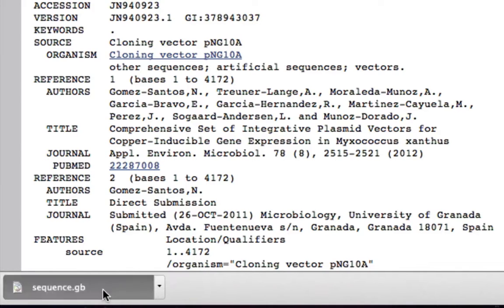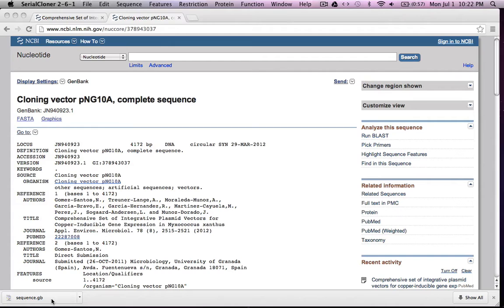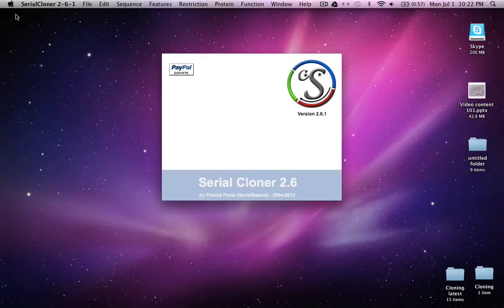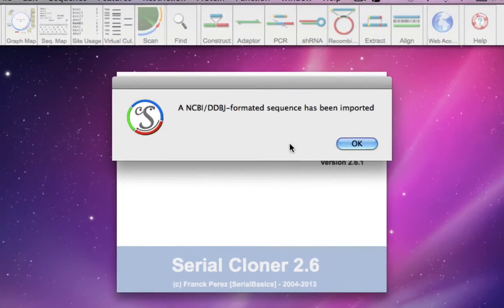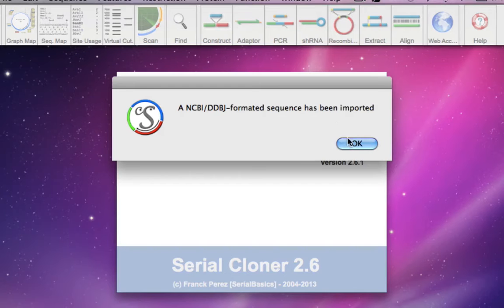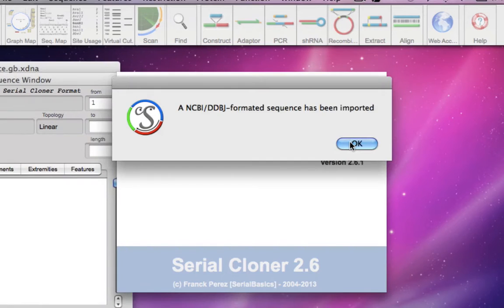Just double click over it. Since you already have the downloaded Serial Cloner program, the file will open in the environment. It says an NCBI formatted sequence has been imported.